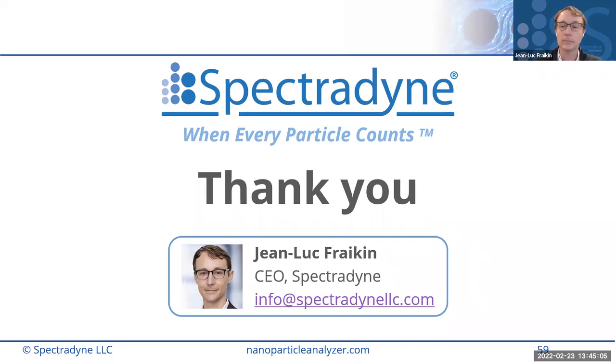Awesome. Thanks again for the talk, Jean-Luc. Just curious, there's a variety of measurement techniques to measure EV samples, and I was wondering how hydration of the sample affects EV size measurements when you're thinking about sample prep for something like TEM versus MRPS or other methods such as NTA. Does dehydrating the sample affect the outcome of your size measurement in these different measurements, and what are your thoughts on that?